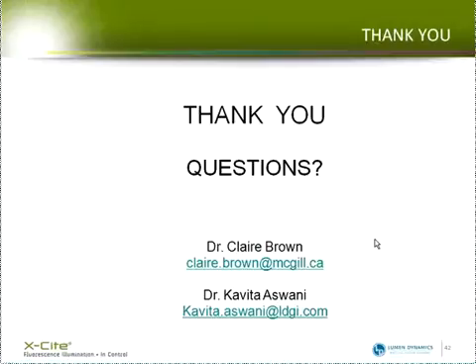Thank you for that, Claire. If we have any questions, please make sure you type them in the chat box on your screen. I'm going to start with a couple of questions that have come in, Claire. The first one is regarding photobleaching of samples. Which one is worse, white light or lasers?